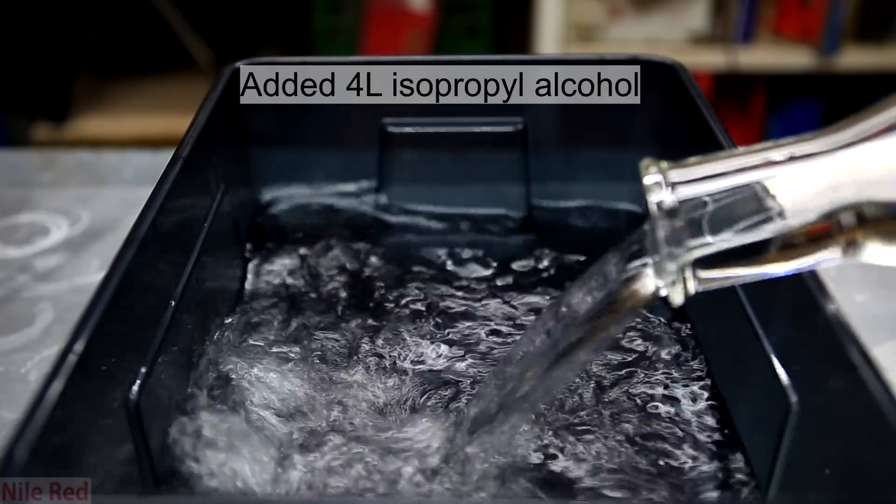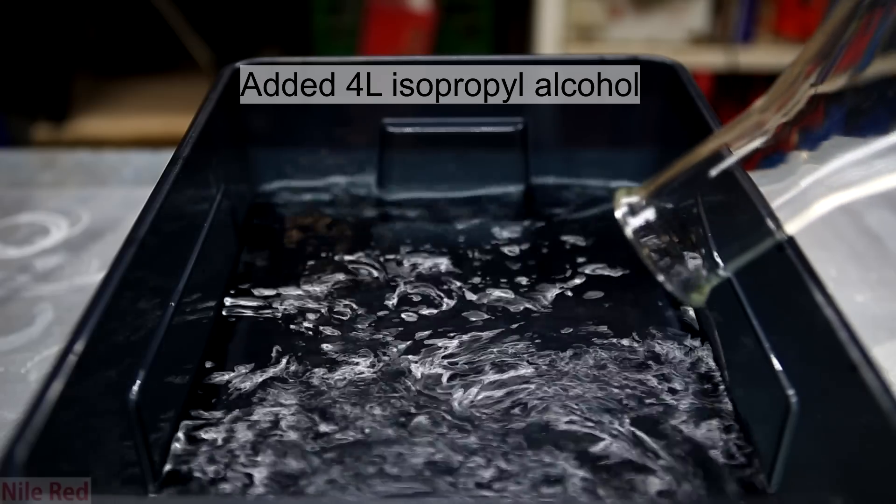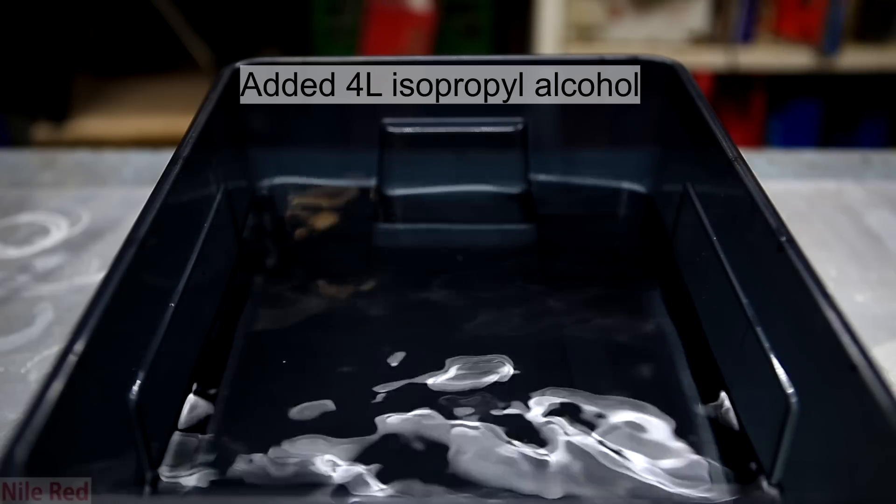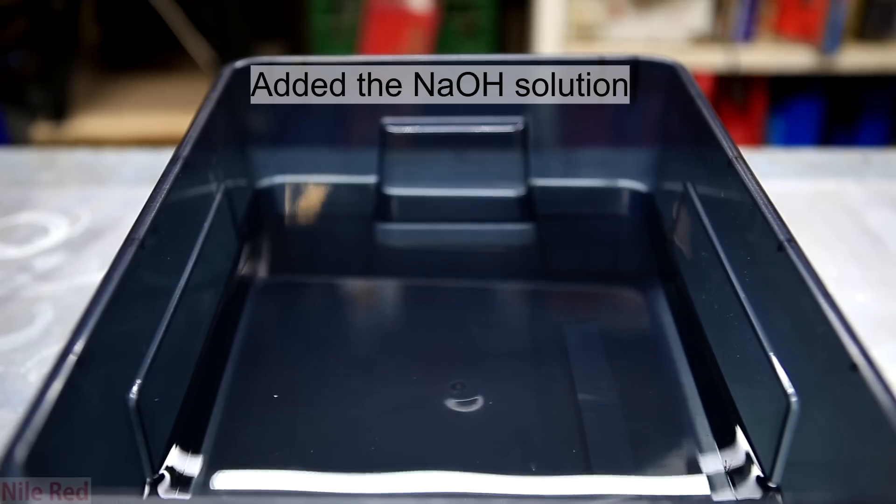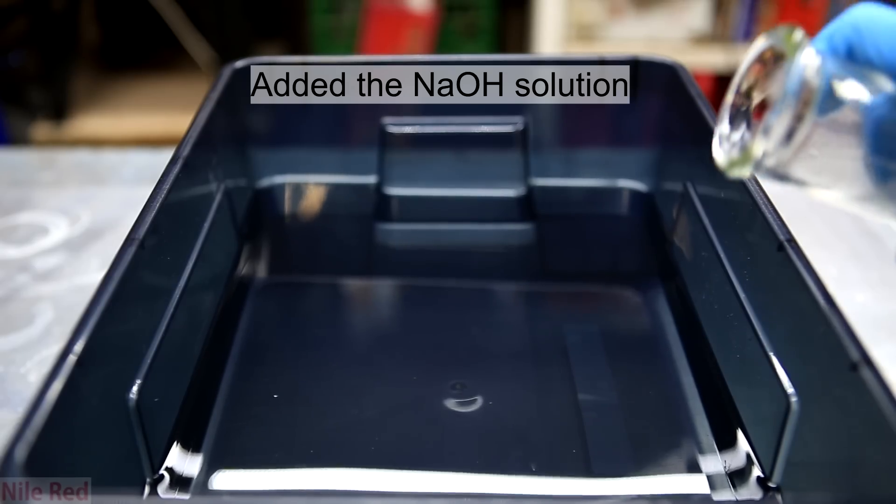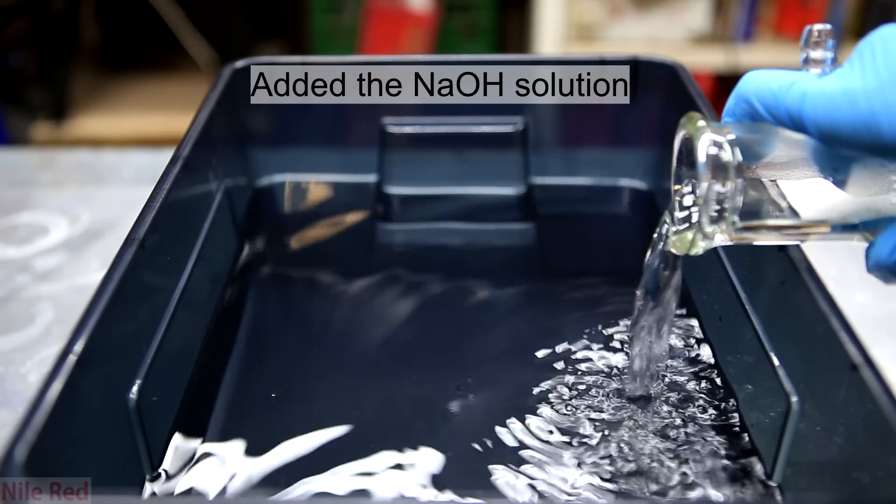Once the sodium hydroxide solution had cooled to around room temperature it was possible to proceed to the next step. To do this is quite simple, you simply just pour the sodium hydroxide solution directly into the isopropyl alcohol.